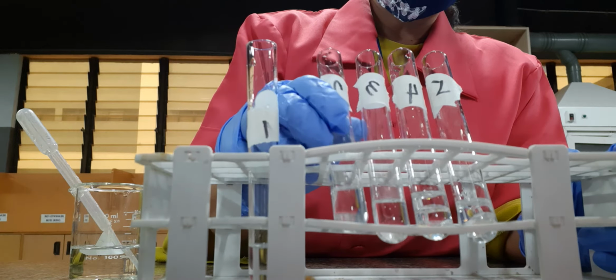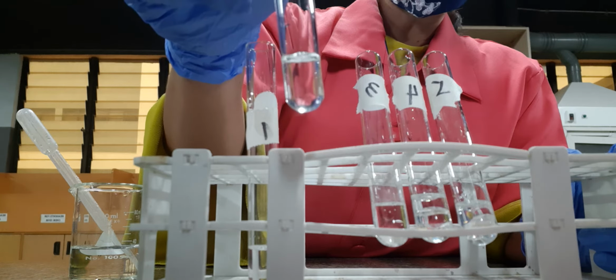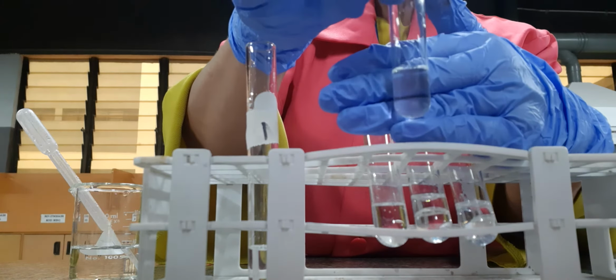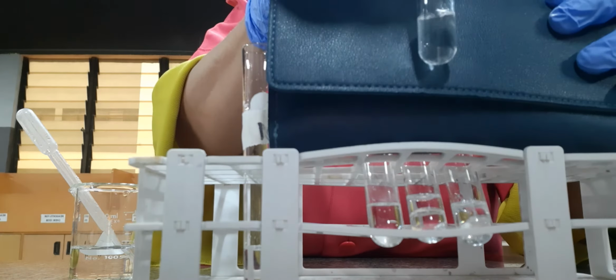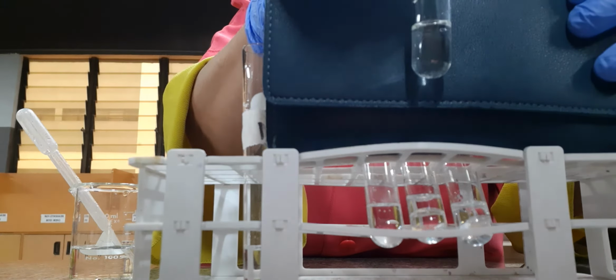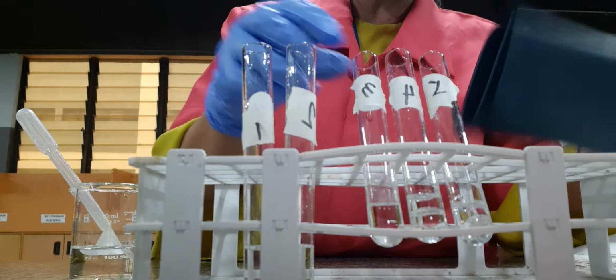Next, we have acetaldehyde. What do you think? We did not have any color or layer form, so therefore they dissolve or are miscible in water.